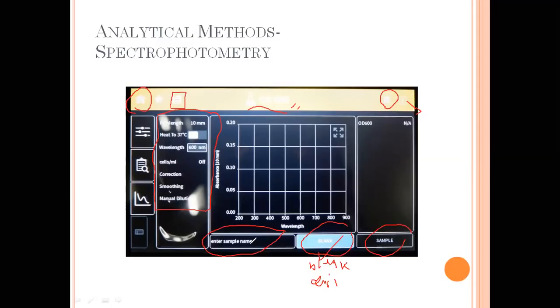So most of the time, kung tayo'y nagkaroon ng face-to-face at nagamit nyo yan, ang ipapalabel ko sa inyo dito is either your group number, so kunwari group 1 yan, or if you want, the last name of the patient. Okay? Kunwari sa group 1, meron kayong naging patient doon, siya yung kinuhanan nyo ng blood that will be used as the sample for measurement of the different analytes.